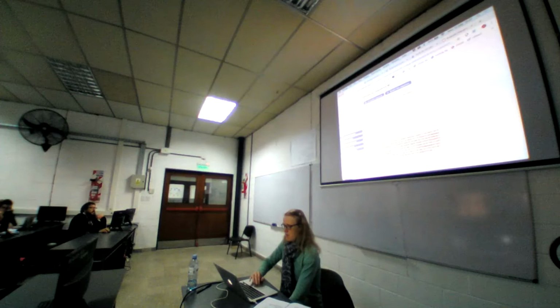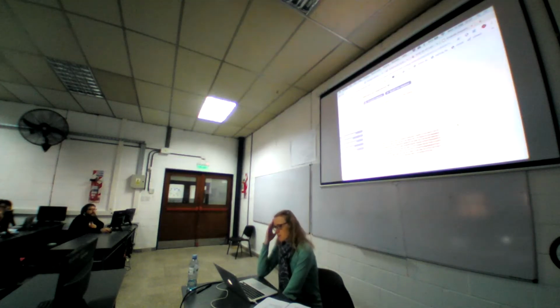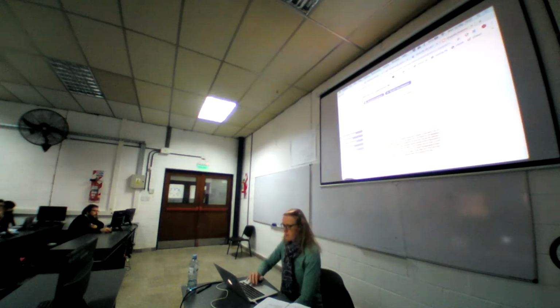And then we have our sequence. The sequence is color-coded, so we highlight all exons with a yellow background, and then the exons of the genes we're looking at, here ESPN, with red letters. So that's an ESPN exon here, and this is a neighboring exon that overlaps.